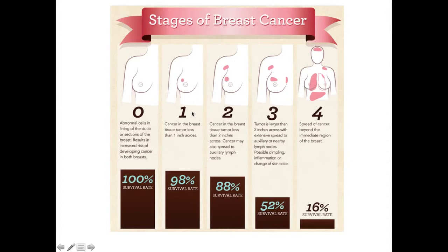So in effect, I'm comparing cancer to itself. It's just a different stage. If I compared cancer to, say, normal tissue, I would get lots and lots of stuff different. This technology, especially when you're doing gene expression, works better when there are only slight differences, when these systems aren't completely different.